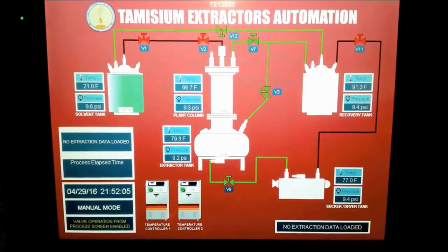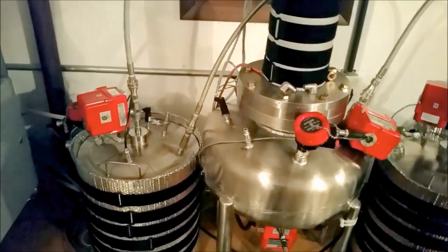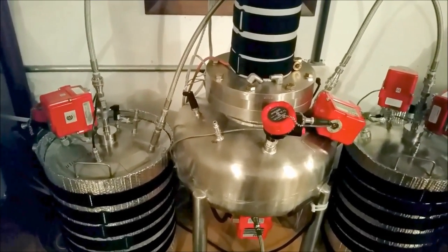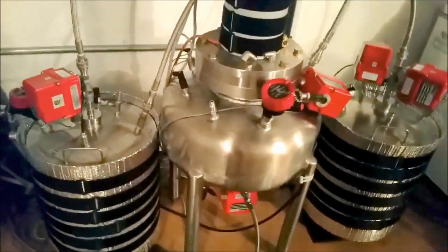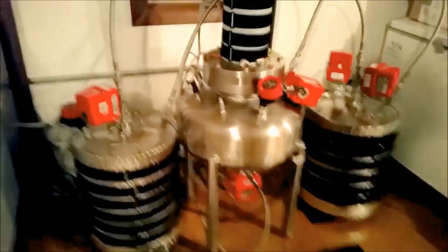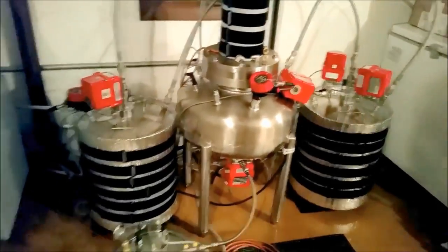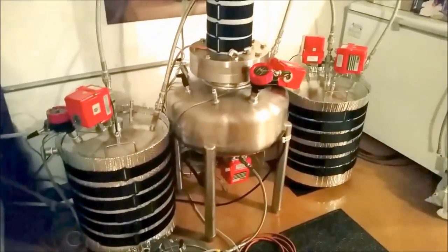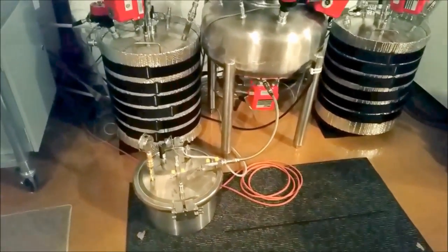There's nothing like it. It can extract and pull out 98 percent of the oil out of four kilos, which is usually on the worst case scenario, a pound to two pounds of oil per run. It can run, depending on the wattage system that you've got, once every hour, once every two hours. With the high wattage, with these low wattage 600 watt chillers, it takes about six hours to recover all of the solvent. But if you had high wattage, it could be done in an hour, faster than you can perform the operations that you need to perform to start your next extraction—grinding your material, loading your column, etc.